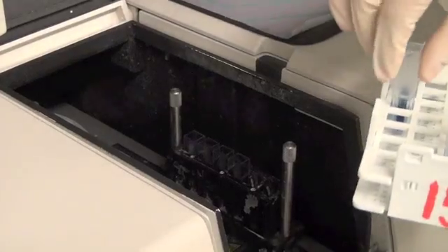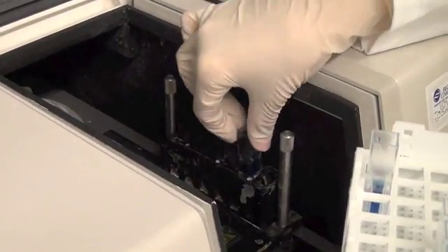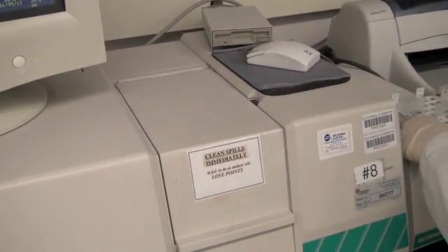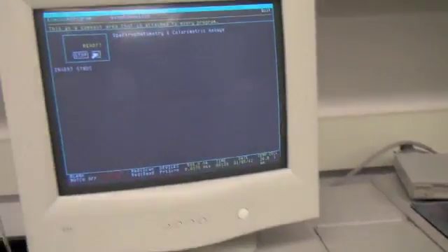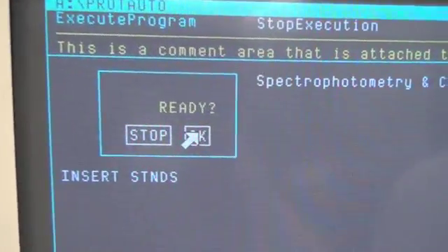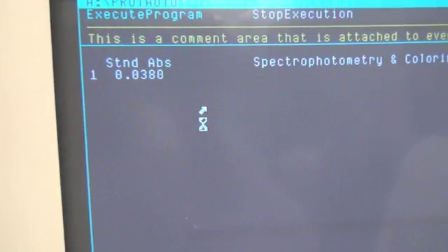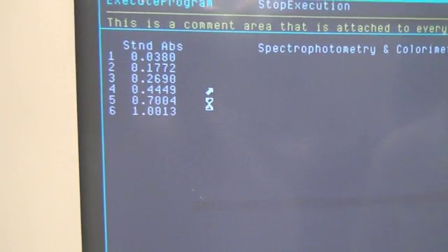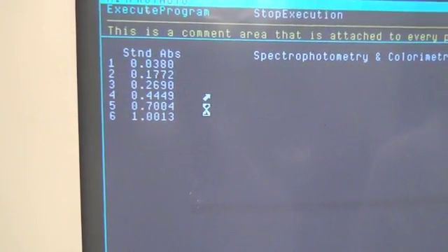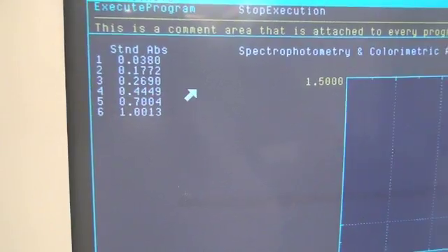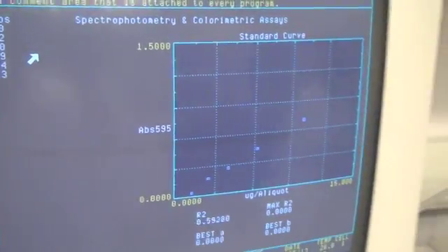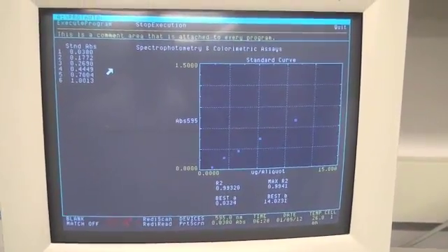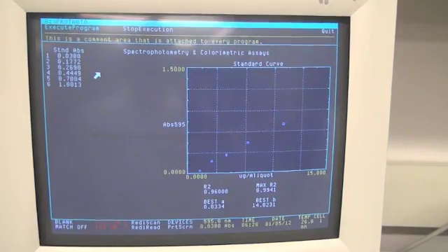Once all six standards are correctly placed into the chamber, then go ahead and close the lid, wait three seconds for the outside light to fully move through the photodetector, and then click OK. You will then see absorbance readings of each sample and a plot appear to the right of the screen. The plot will only be used for qualitative purposes of determining whether your standards were made properly. Never use the plot on the screen for actual data analysis.